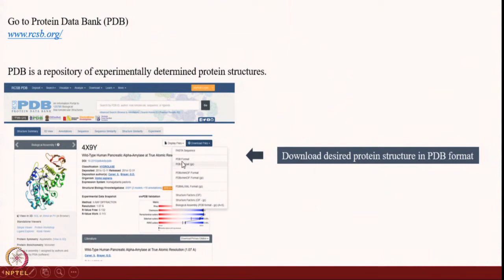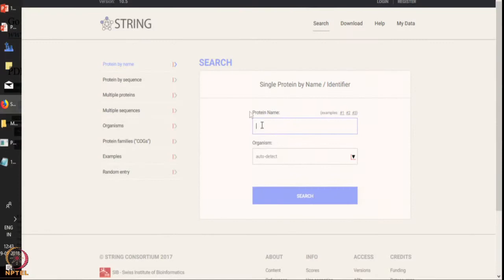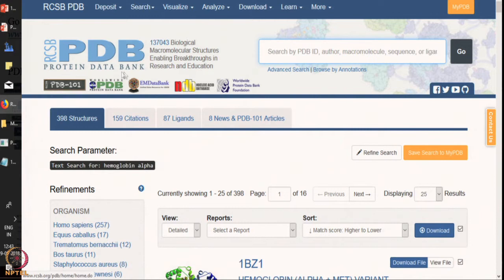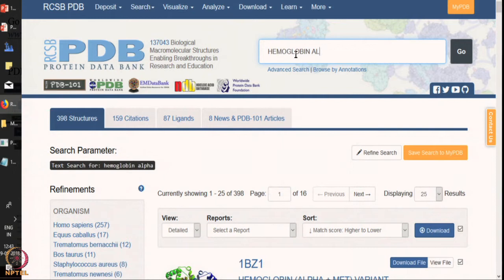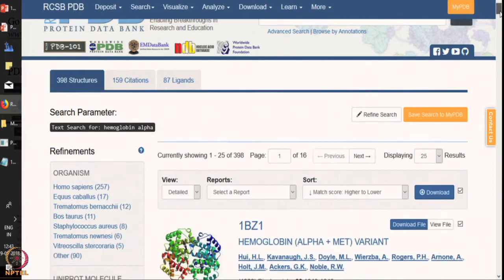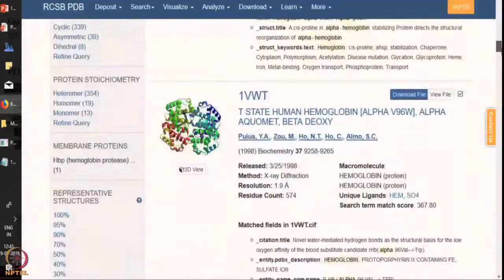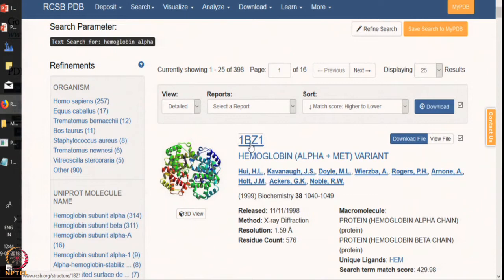You can download the FASTA sequence, you can also download the PDB format of the protein. Let's go directly to the PDB. Now if you go to the protein data bank, you can see there are many tabs. Here you will search for hemoglobin alpha. Immediately after the search, you can see there will be various structures of hemoglobin available. Let's click on the first one, 1BZ1.